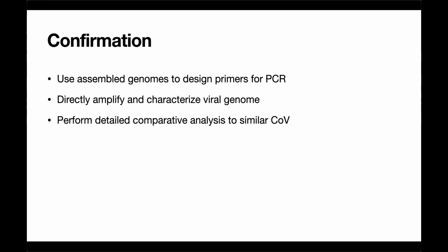All right, so you do high throughput sequencing. If it's an RNA virus, you do transcriptomics, so you have to do RNA sequencing. Then you do a lot of heavy duty computational lifting to assemble these short reads into longer reads, filter them, throw away human DNA and everything else that is not a virus. Then you come up with a candidate genome, and then you have to do additional confirmation in order to establish for sure that you found something that's real.